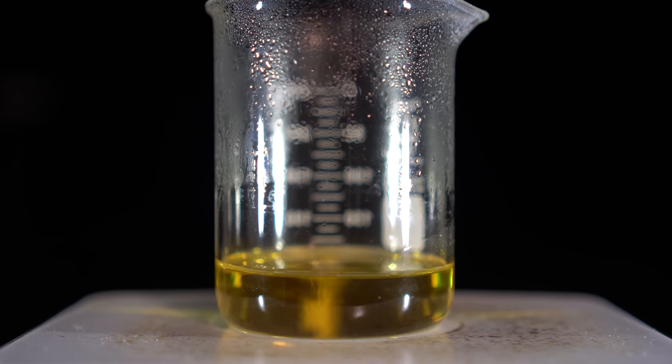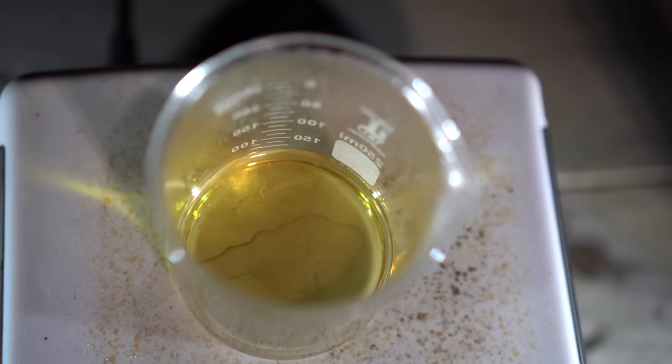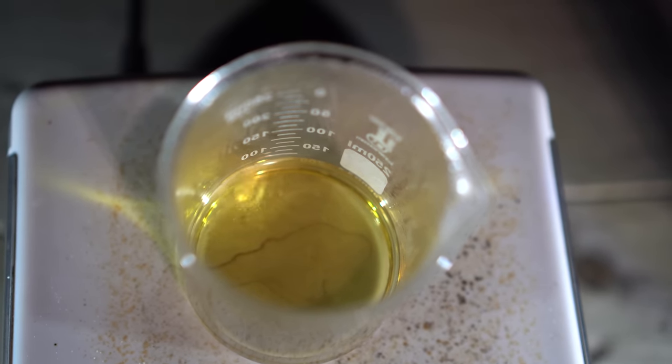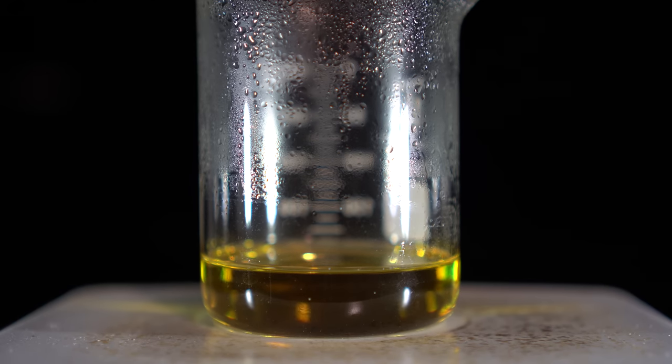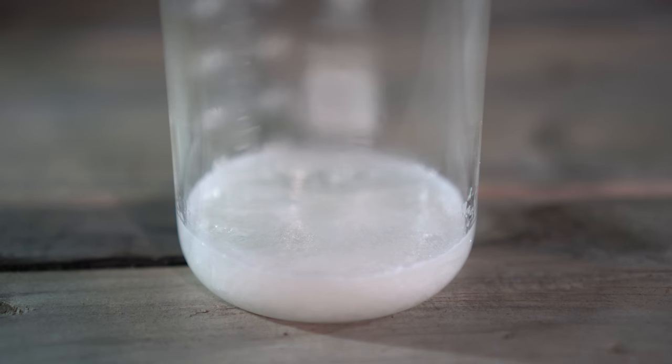I didn't have too much silver left and the reaction didn't take too long to finish. A good idea is, once all the silver is dissolved, to let it run for another five to ten minutes on the hot plate just to make sure everything has reacted. Once everything had reacted, I turned off the hot plate and let it cool naturally down to room temperature.